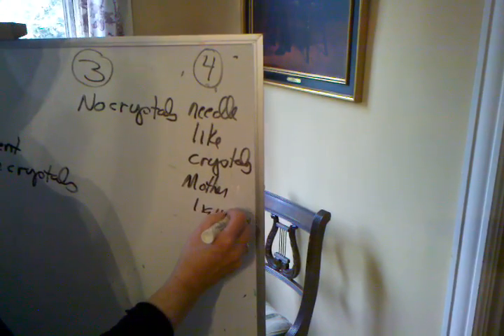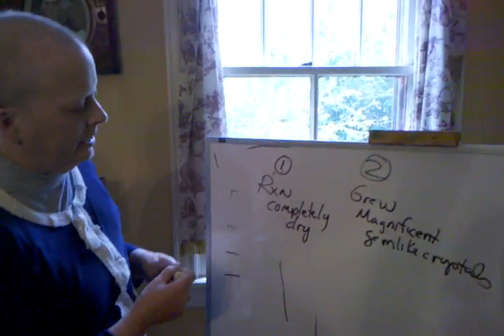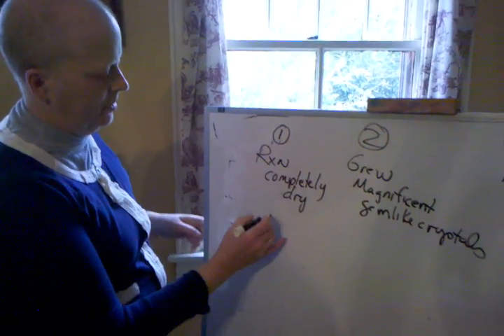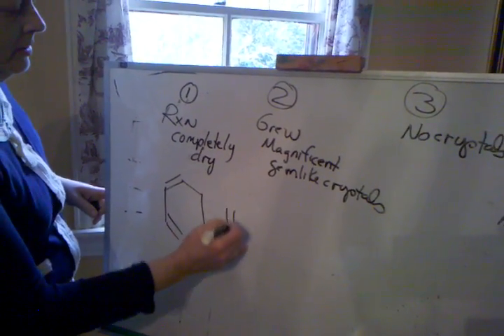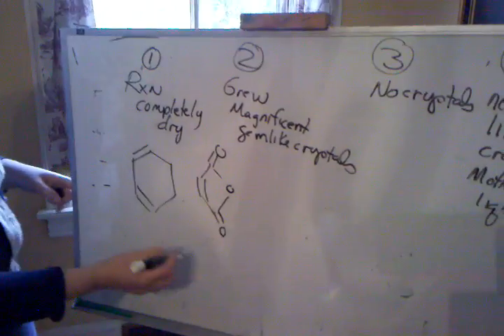Okay, so let's talk about these situations because they really demonstrate what crystallization is about. All right, the reactions involved, just as one example of the Diels Alder which I went over, you're basically making this. And I went over this theory.